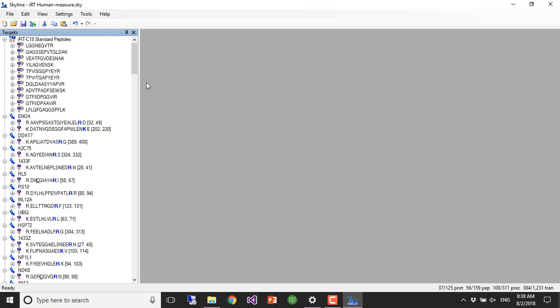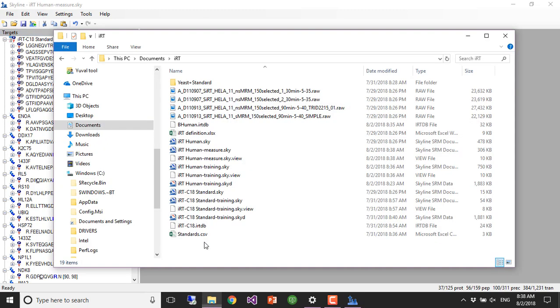So the first thing we have to do, though, is to get a measurement on our new system, and I sort of forced them to, in the paper, to do it switching from 30-minute, or I think it's 45-minute, to 90-minute.